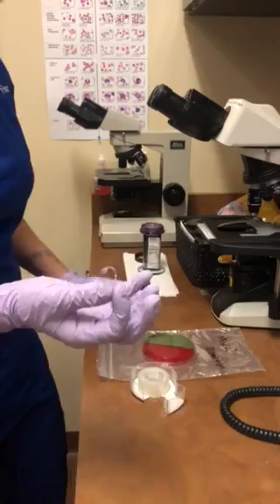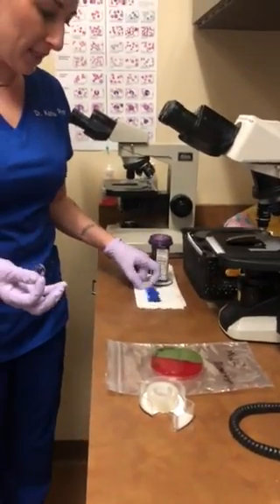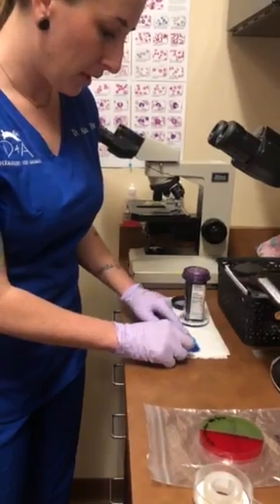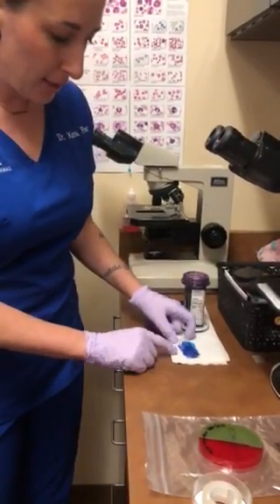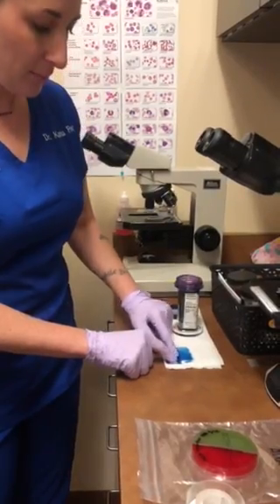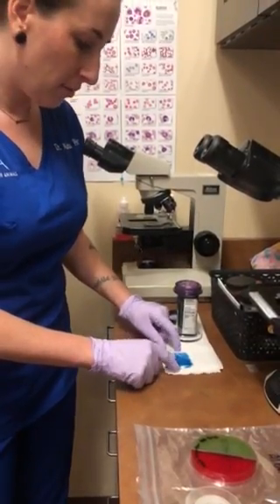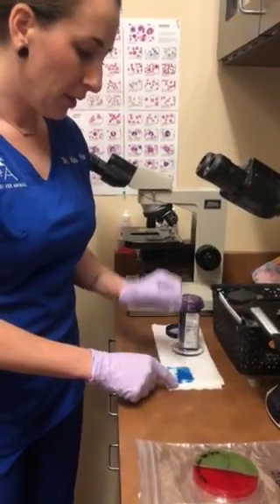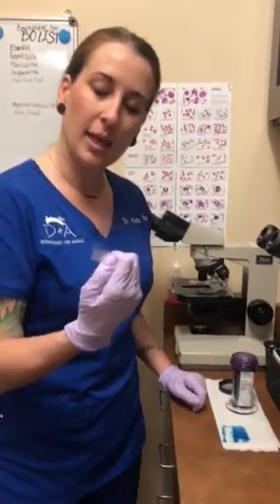So you've got your sample and your pre-stained slide. You're just going to press your tape to the slide like that, then flip it over and push out the air bubbles and the excess stain, and then you're good to go. You can take the slide and look at it under oil under your microscope.